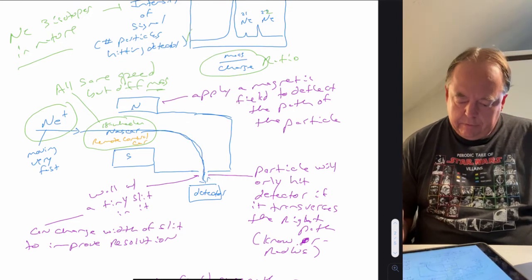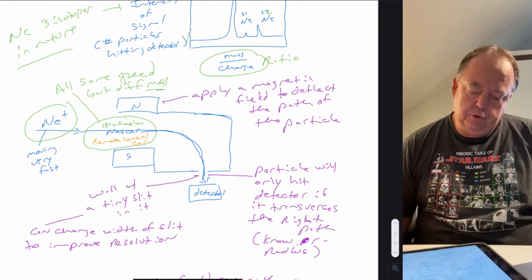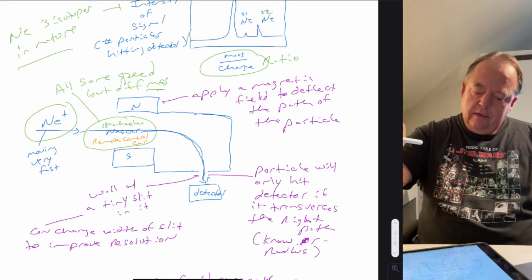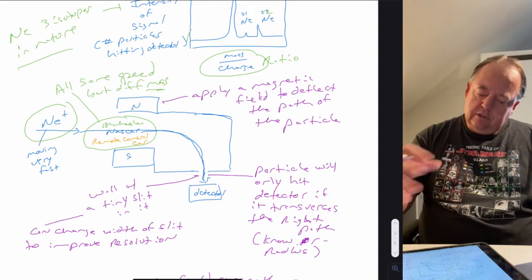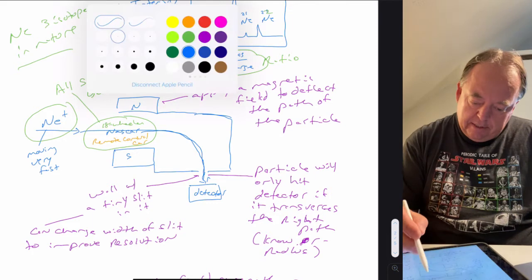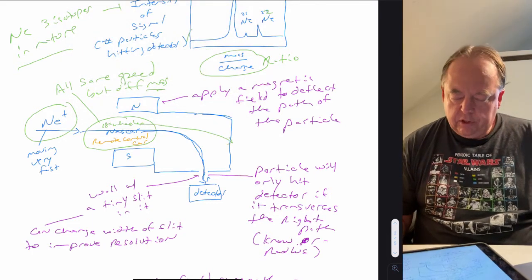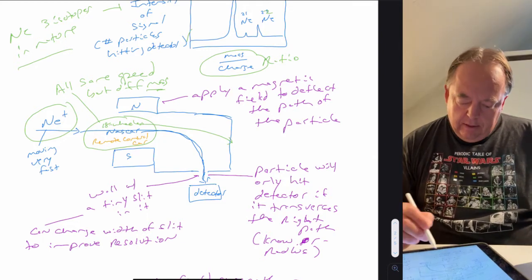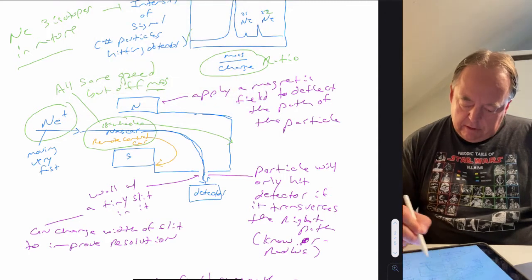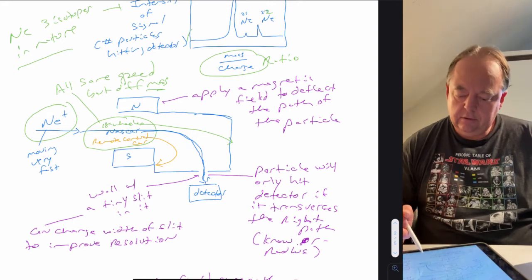They're all going the same speed, so what would you expect to happen to the 18-wheeler? It has a heavier mass, so what would you expect? If you were driving the 18-wheeler and you got it going really fast and you put it through a corner, and let's assume everything can keep traction and not flip over, then what would you expect to happen to the 18-wheeler? Well, because of how massive it is, it's going to tend to want to keep going on a straight line and it's going to hit the wall. And the remote control car, conversely, does not have much mass, so it's going to be deflected too much and it's going to hit the wall. And only the NASCAR would hit the detector.